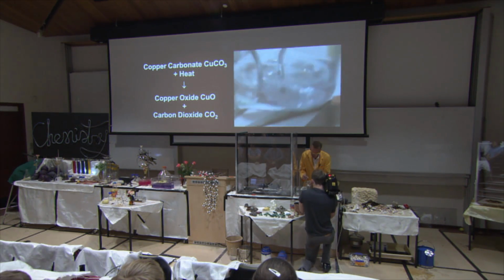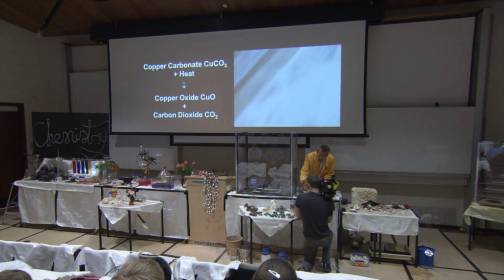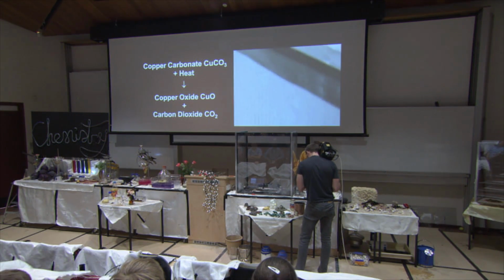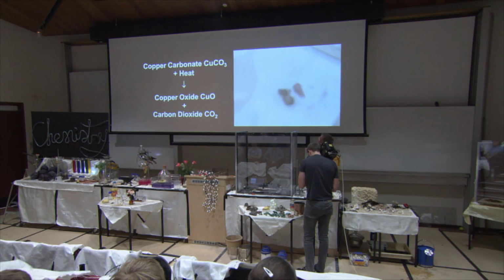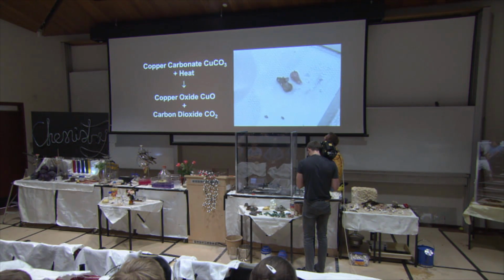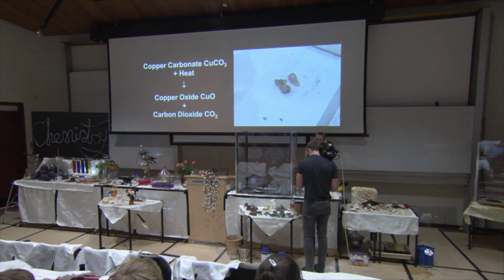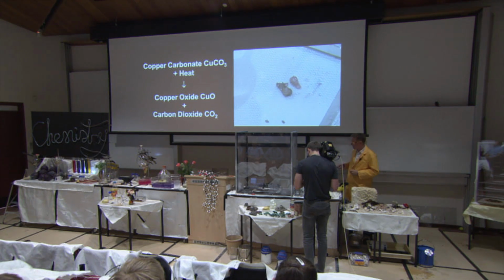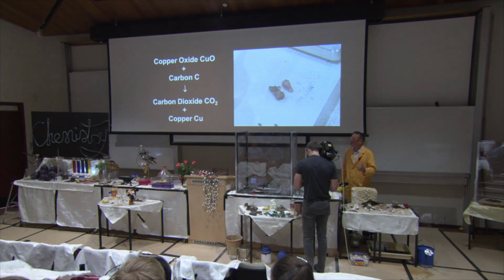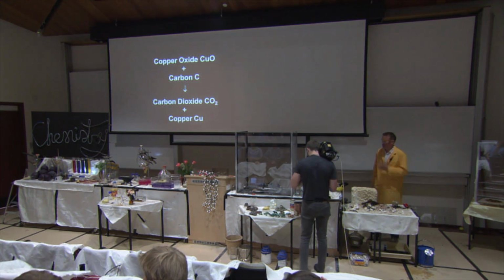And you can see, I think, that what we've got now is a nice piece of copper. It's still a little bit mucky, but here's a piece that we did from the previous lecture. Okay, and you should be able to see that what we've got there is copper metal. And that has just been made from the naturally occurring copper mineral, the malachite, the copper carbonate. So we heat up the carbonate, drive out the carbon dioxide, make copper oxide, and then we use the carbon there to steal away the oxygen from the copper oxide to leave the copper metal. And that's what we've made.